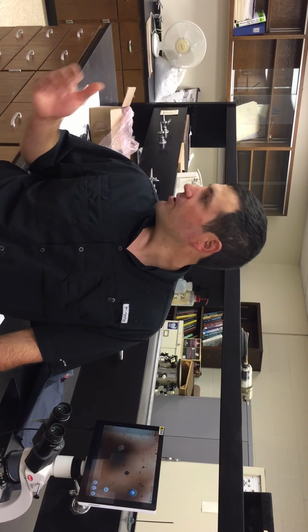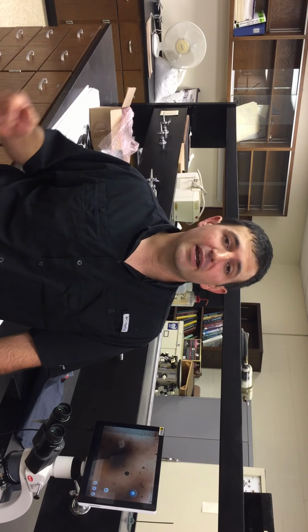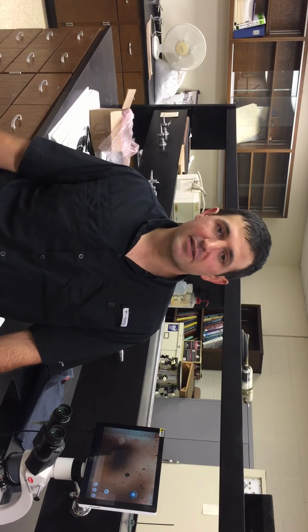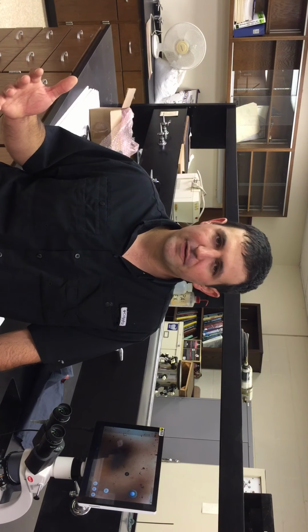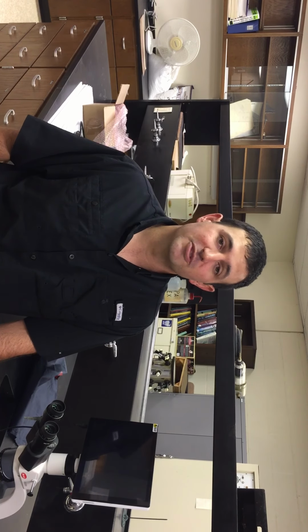This kind of information, we've got all the supplies here. It may be a bit tricky for you to do at home, but the AgriLife Center is actually going to be offering this as a commercial service to the industry here in the near future. For a few bucks a sample, you can send in your samples. We can give you egg count numbers, and you can go ahead and enter your own information in NSIP if you wish. We're not offering a diagnostic service for which type of parasite. That's not necessarily the case. We want to give you some numbers that reflect parasitism amounts within your animals, and that'll allow you to select for those animals that are more resistant.